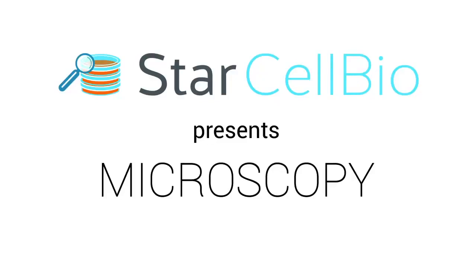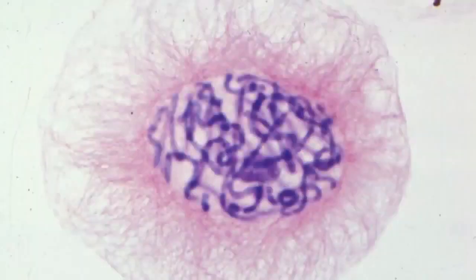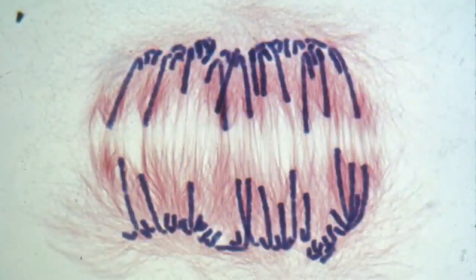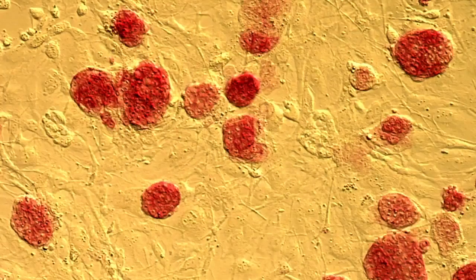In this animation, we will introduce you to the microscopy experimental technique and a basic light microscope. Microscopy is used to study the shape, morphology, and properties of cells, tissues, or organisms that cannot otherwise be seen by eye. Microscopy is also used to determine the presence or absence of certain types of cells or organelles in a sample or specimen of tissue, as well as to count the number of objects in a specific volume, for example, the number of cells in a sample.